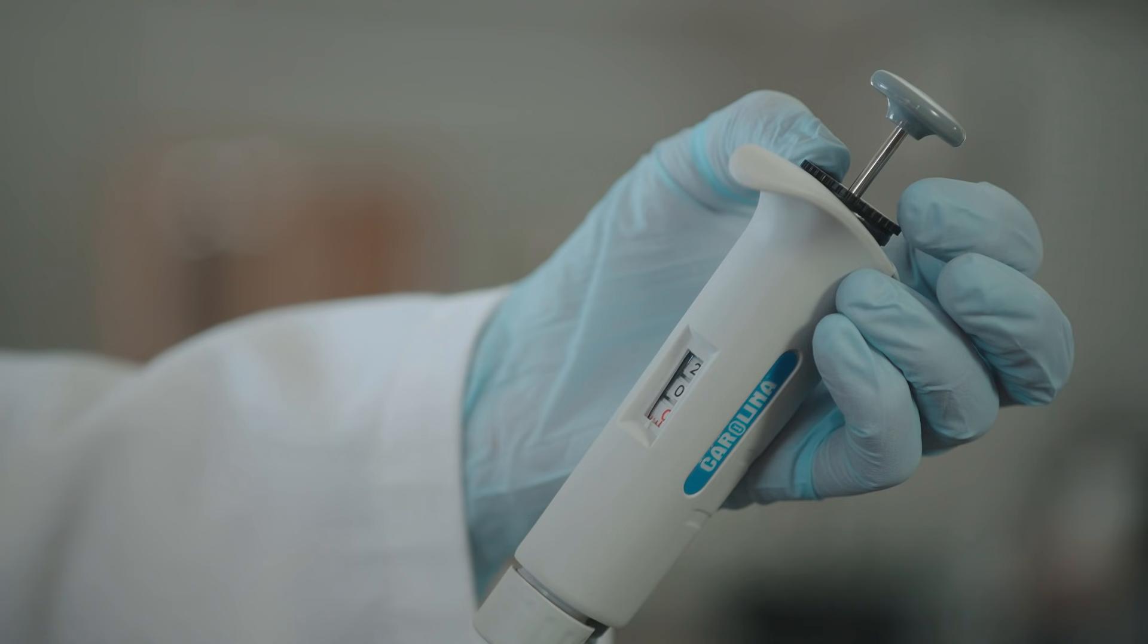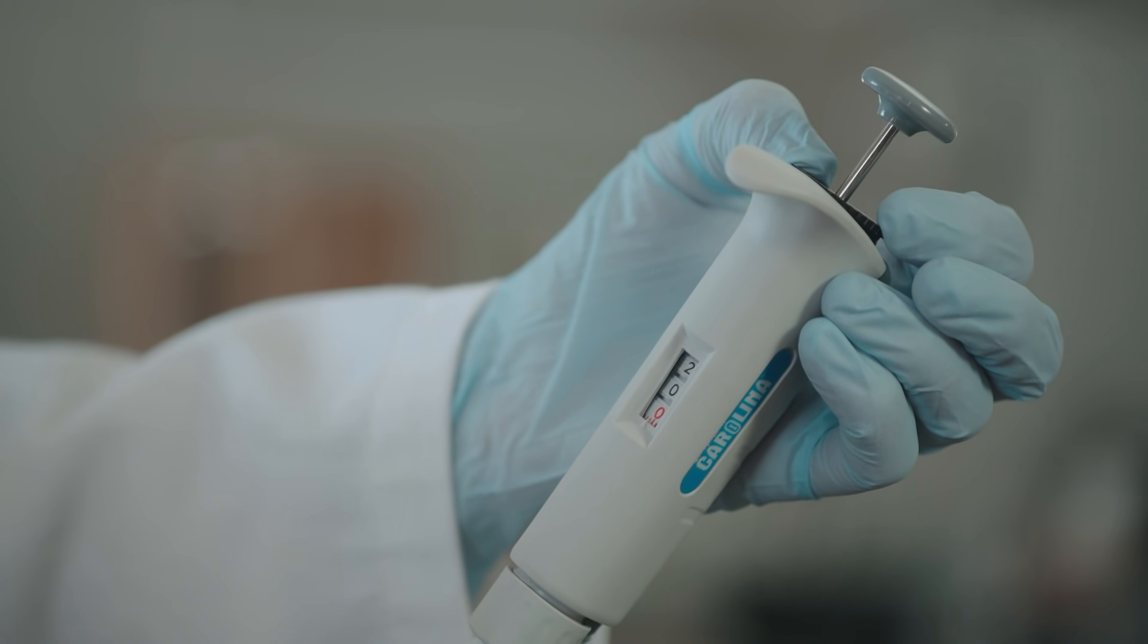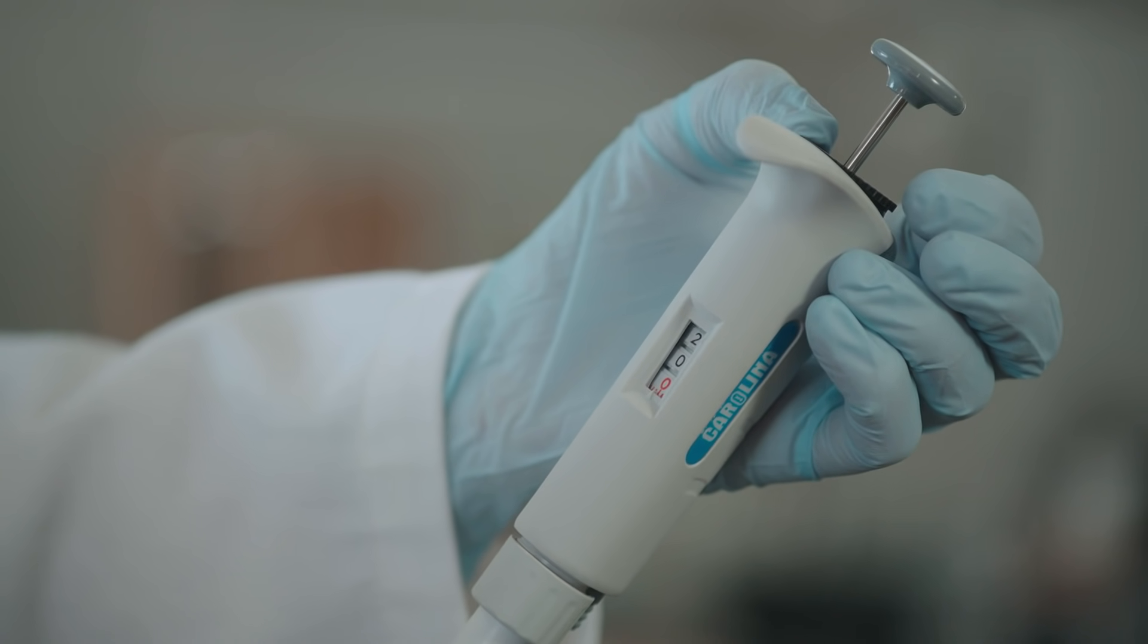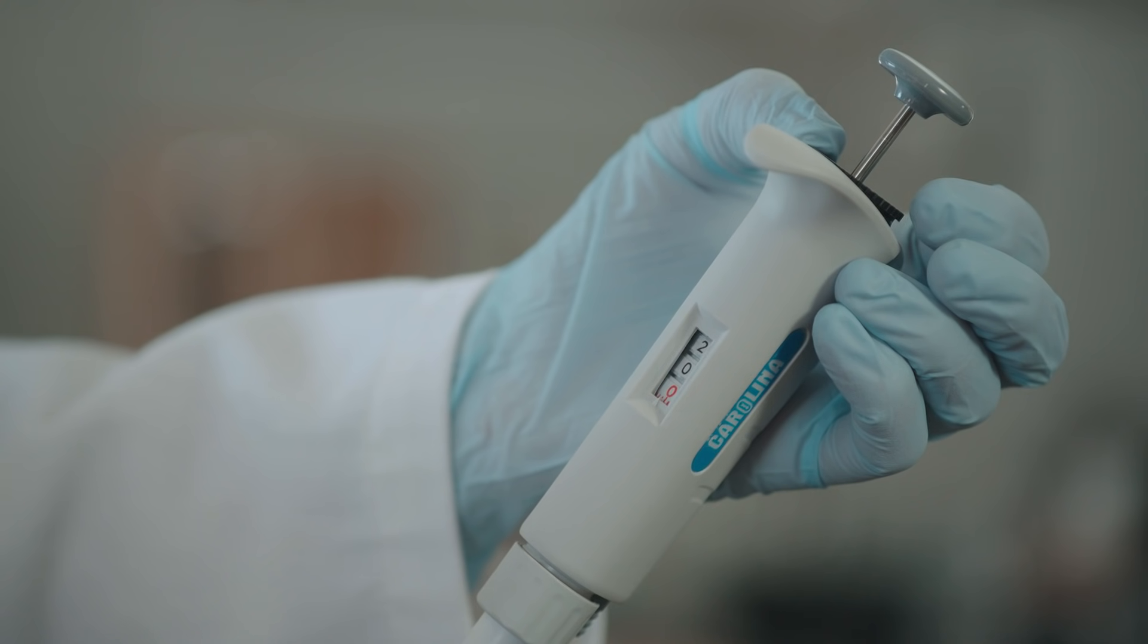Once you have finished adjusting the pipette volume, push the black wheel back into its original position. Never adjust the pipette volume outside of the volume range it is designed to measure. This damages the micro pipette.